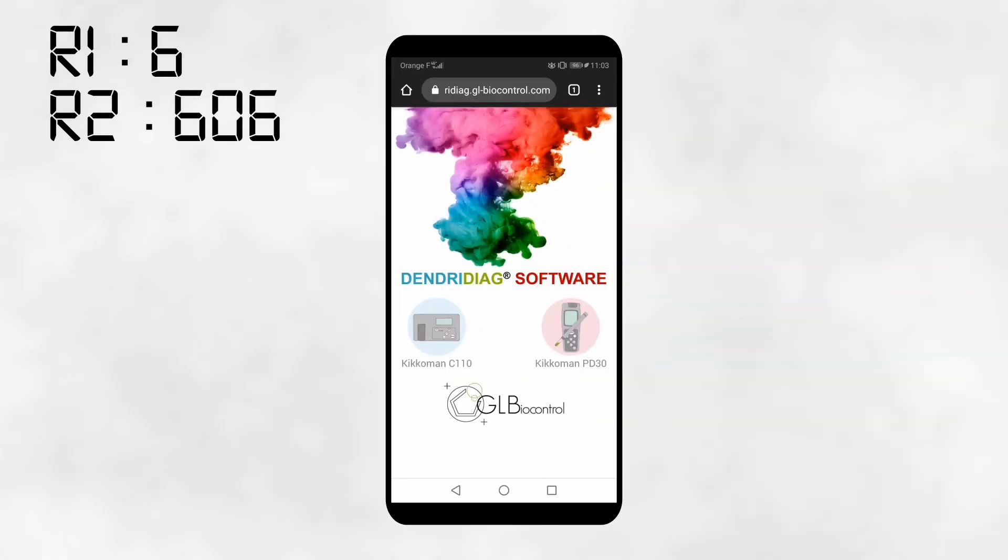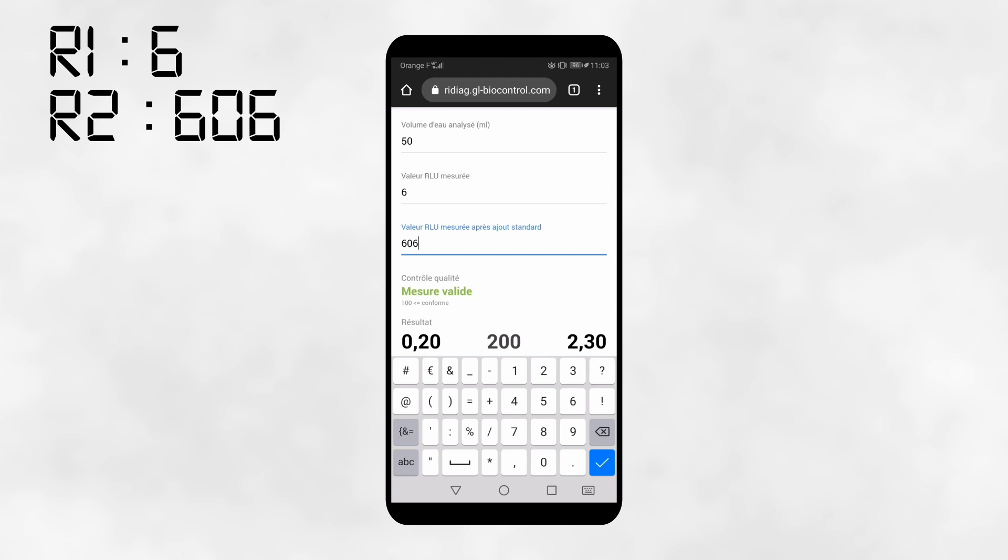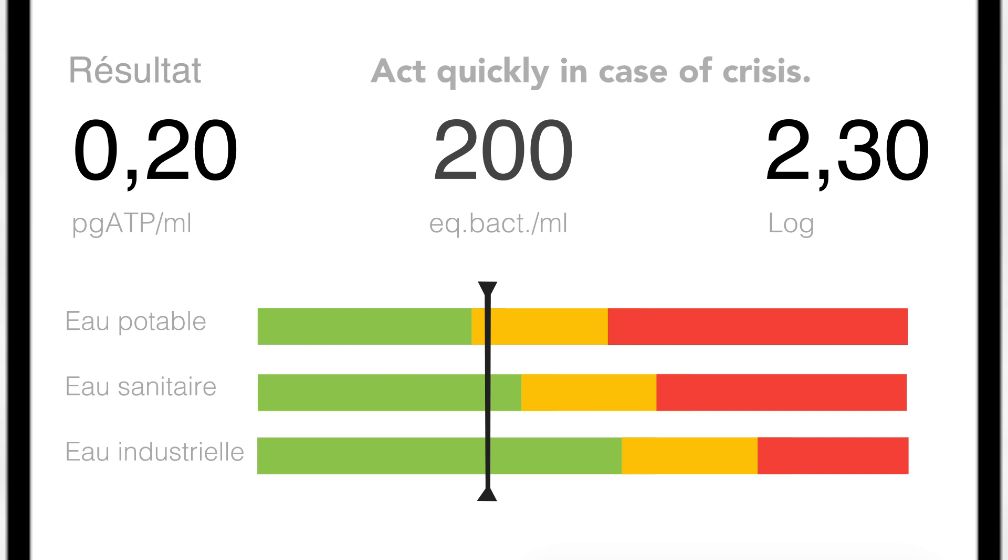An app helps you interpret your results directly. Enter the volume and the two results obtained. Simple as that. The app specifies the quantity of bacteria in your water. Thanks to a colour code, you're informed if a corrective action is required.